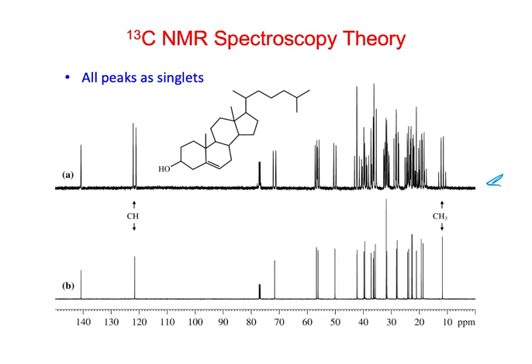The first one is pretty smooth, but you can still see some noise in there. It doesn't really look like a proton NMR spectrum, which would be much smoother than that. But the signal to noise is pretty good in both of those. We don't really have any problem picking the peaks out of the baseline.